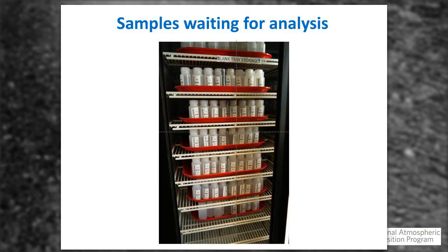So this is very high-level QA data, and we purposely make them somewhat anonymous to the analyst. They just see a lab number. They don't know whose site it came from, who funded the site, or anything. They just come through, including replicates and quality assurance samples.